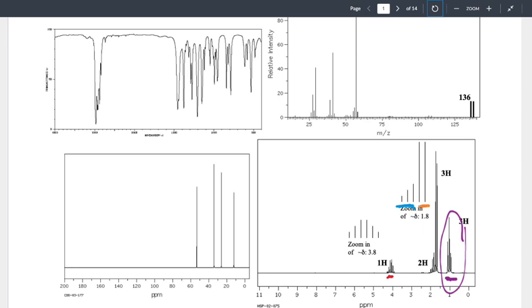Very often I'll get people saying, but isn't that right there a peak, and then a peak, and then a peak, and then a peak? And I can totally see what they're trying to get at. They see those shoulders behind it. And when you look at some of our spectra, they look very much like that.